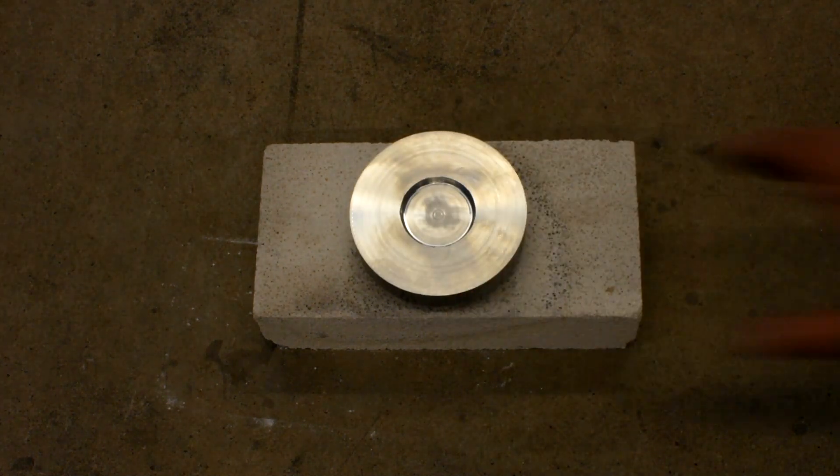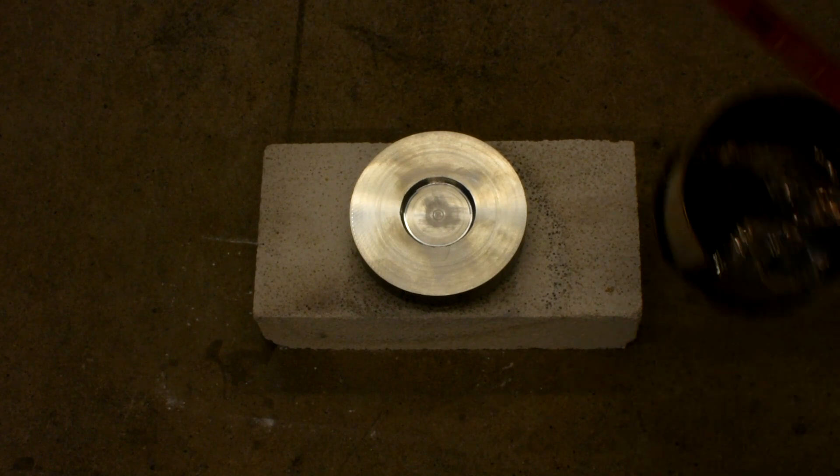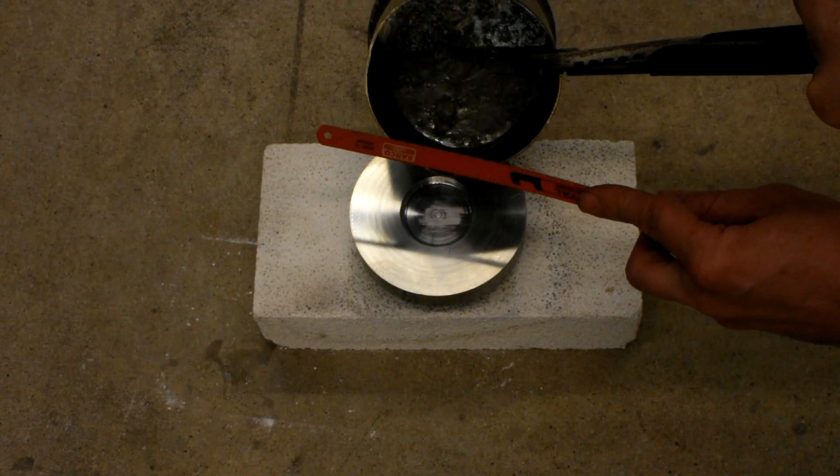Now we're going to cast some bismuth into this aluminum mold. We use a hacksaw blade to help separate the slag layer as we're pouring the molten bismuth into the mold.